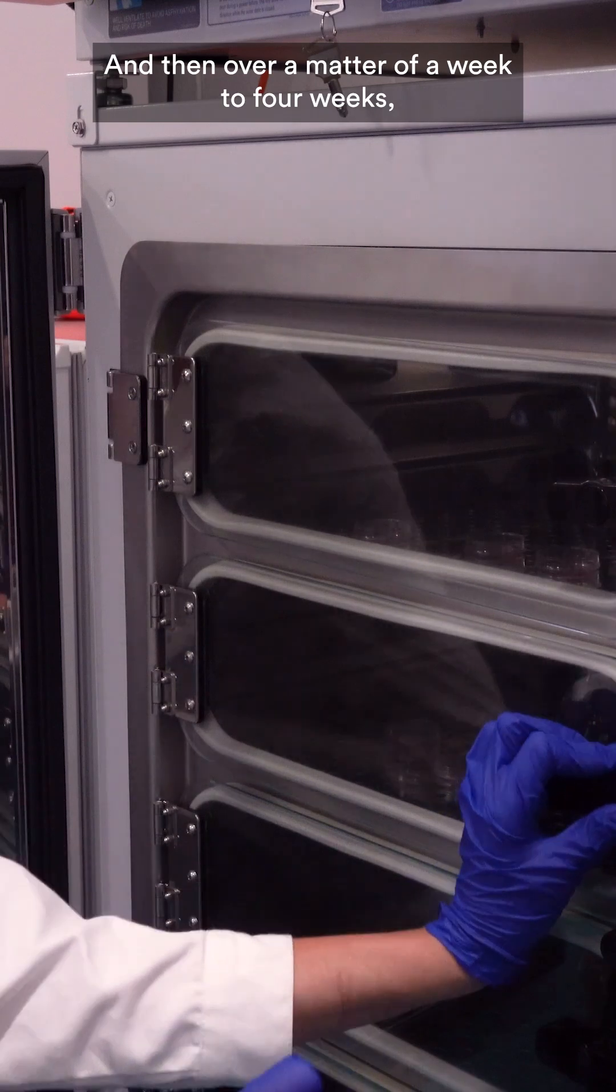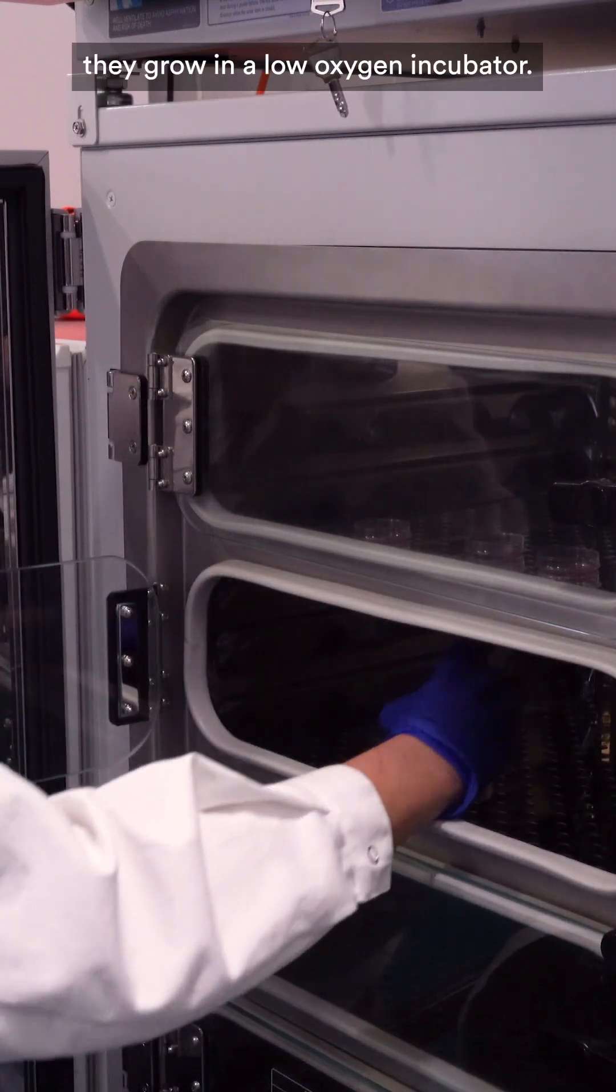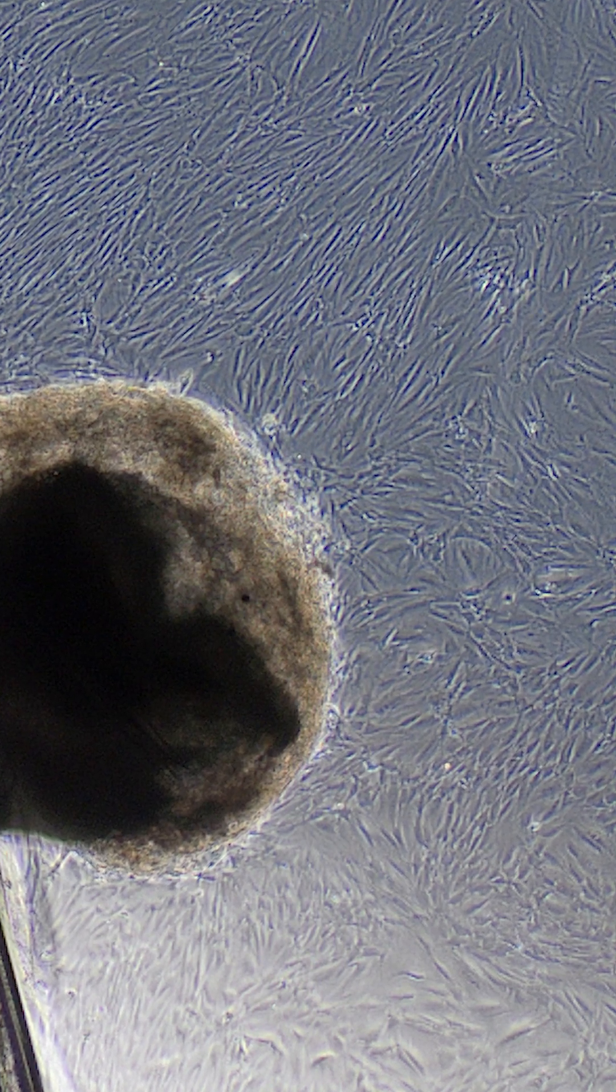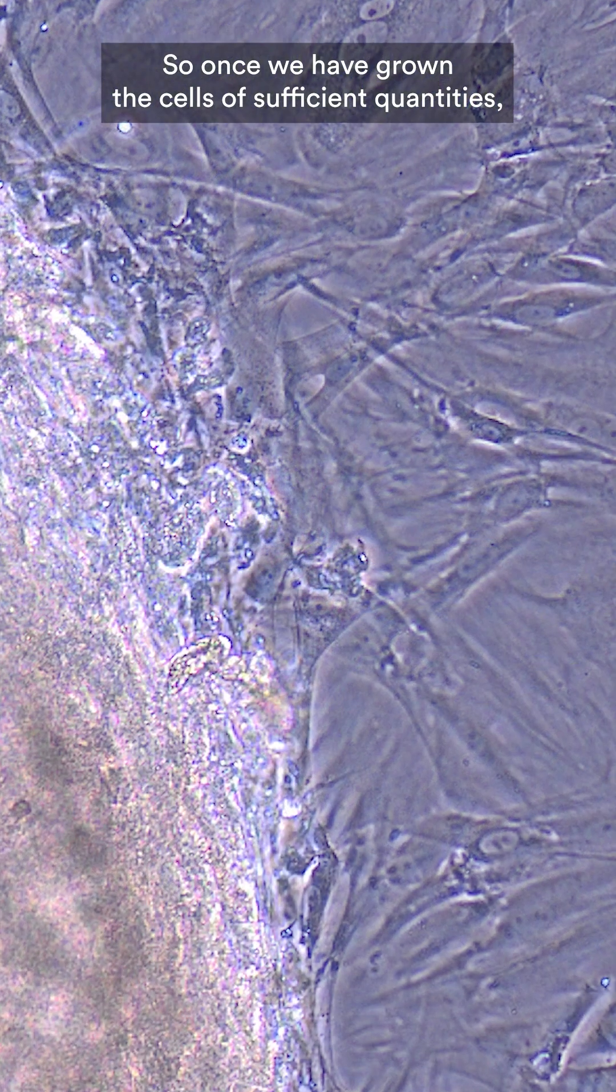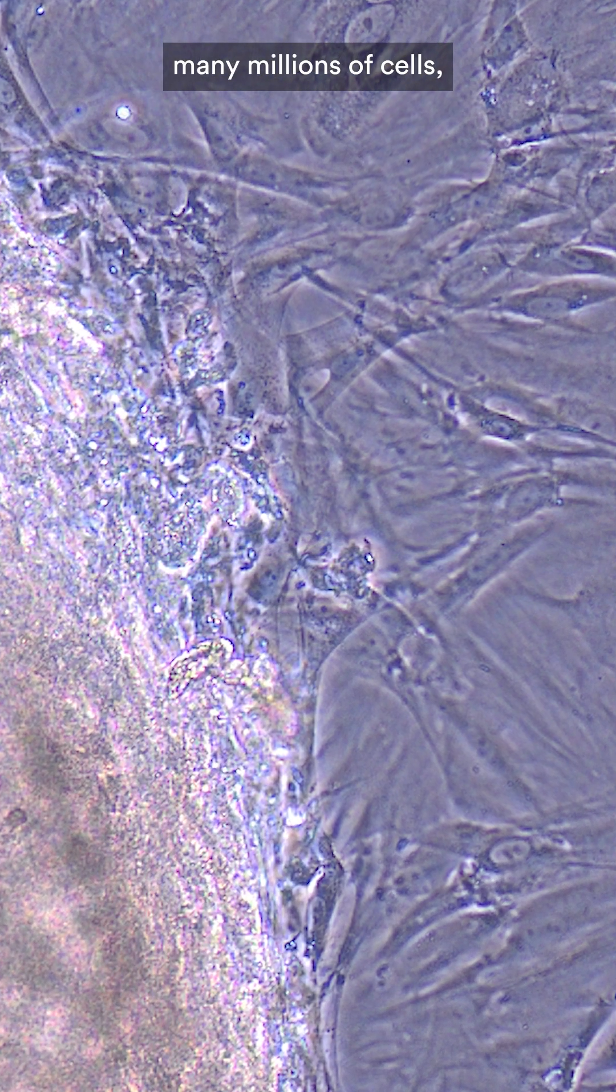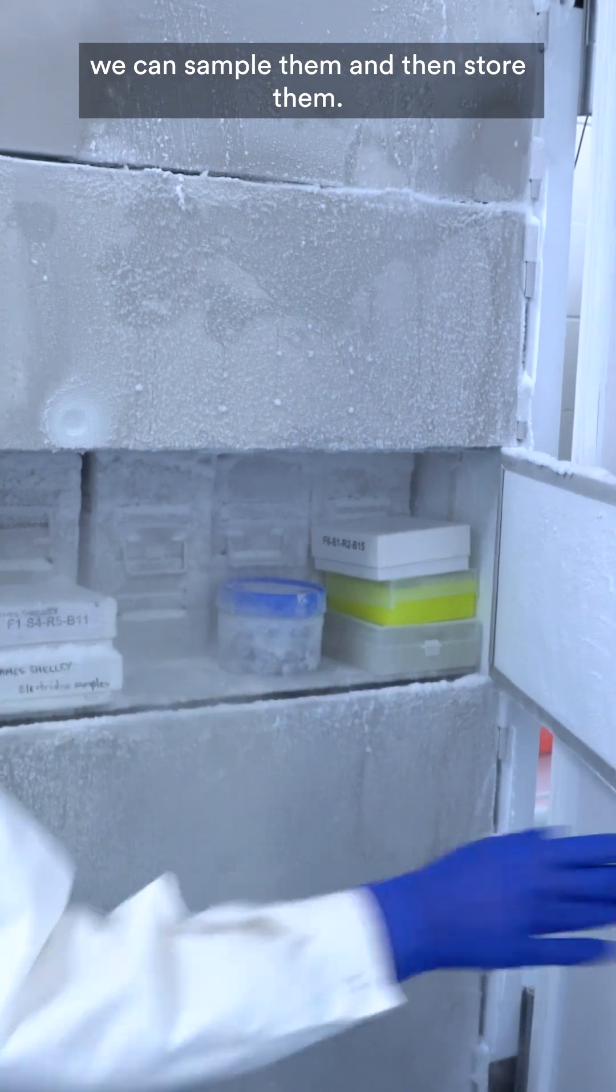Over a matter of a week to four weeks, they grow in a low oxygen incubator. Once we've grown the cells to sufficient quantities, many millions of cells, we can sample them and then store them.